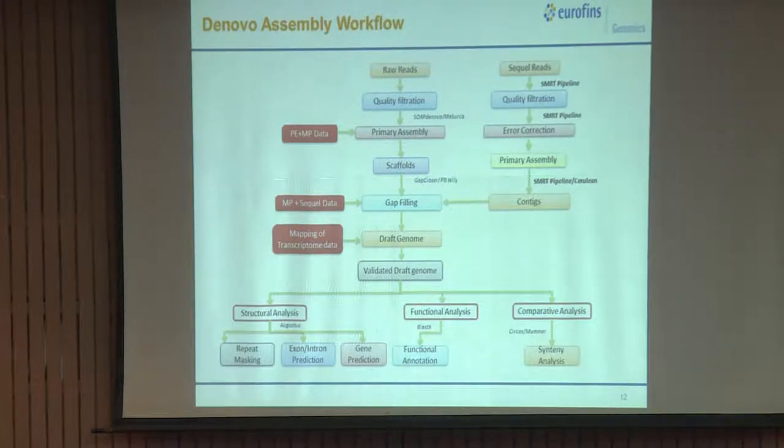Now, the SMRT platform filters the data and gives it to you using the SMRT Analysis software, which is already there in the system. It filters the reads based on quality, so all the bases in the PacBio read will be of the same quality, right. So, you do not have to filter it based on quality. Now, what we do is use the short reads, map them on the PacBio data using software, and correct the PacBio reads. The reads which have more indels or more insertions, where we see any ambiguity, we remove from my data. And then we take all those data together and do a hybrid assembly.